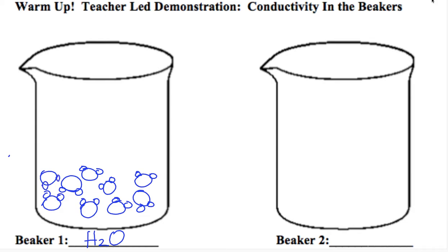That was exciting. All right, this next beaker is going to be a 1 molar potassium iodide solution. For those of you at home, this is a beaker that is a clear solution. There is nothing floating around in it, so it's fully dissolved.